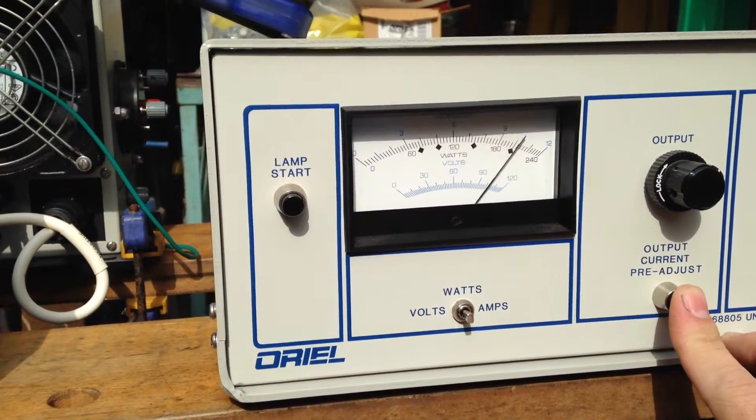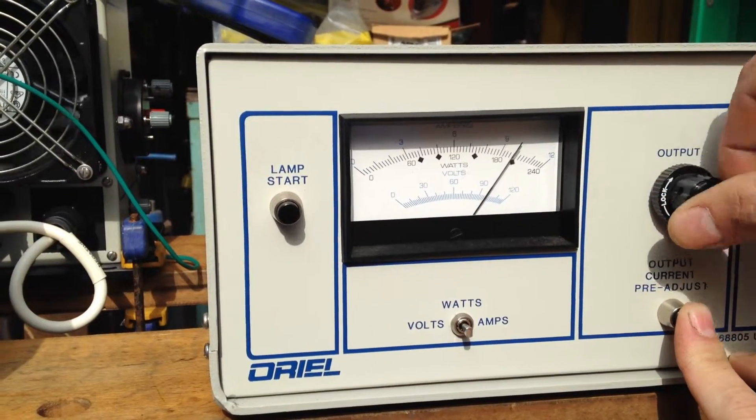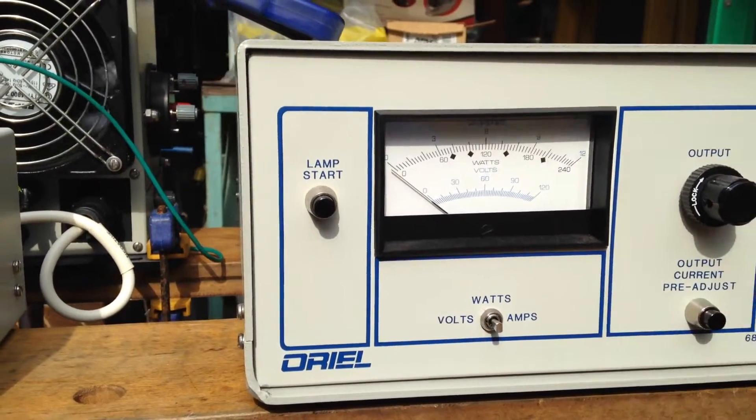Current pre-adjust. You push this, it shows where the current is going to be when the light comes on. And yeah, you can alter it to adjust there. And then there's a lock ring you can lock it.